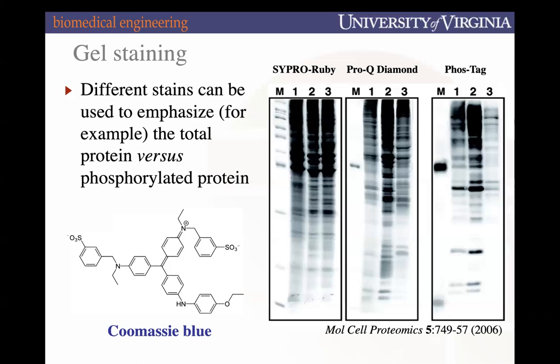If you're leaving the proteins in the native gel, what you can typically only do is some sort of stain. We're going to talk about a method next class where you'll transfer them to something else that allows you to use antibodies to probe for specific proteins. But this is a visual, you can see it in its own gel without further testing. Exactly, yeah.